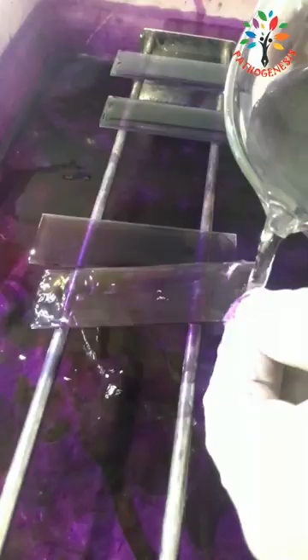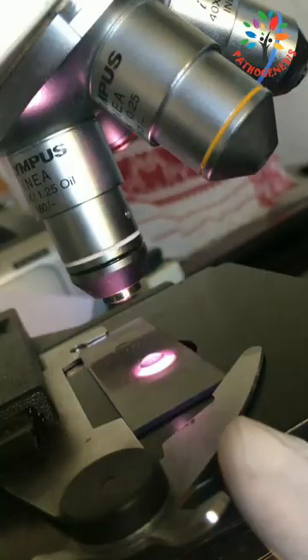Wait for eight to ten minutes, then wash in water for one to two minutes. Next, air dry and observe under oil immersion.